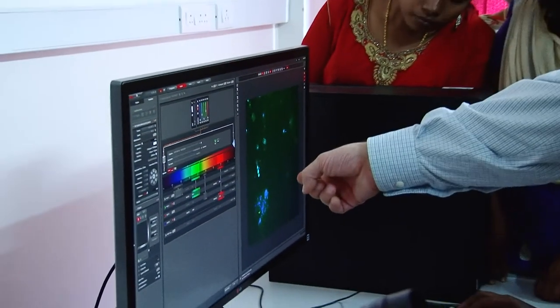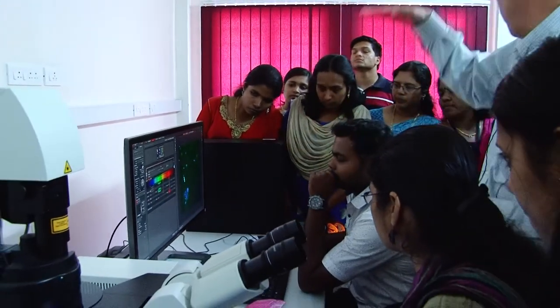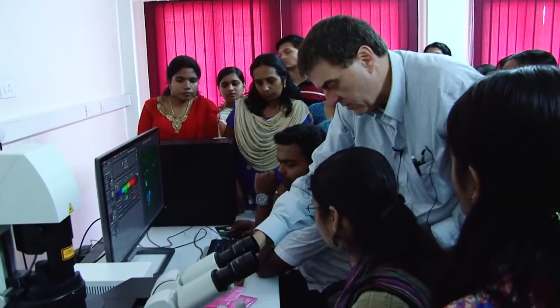See how it sort of went out of focus? So he's gonna, so stop. He's gonna pick the top. Remember we talked about making a Z stack, right? So a little bit out of focus, that would be your top. And now go the other direction.